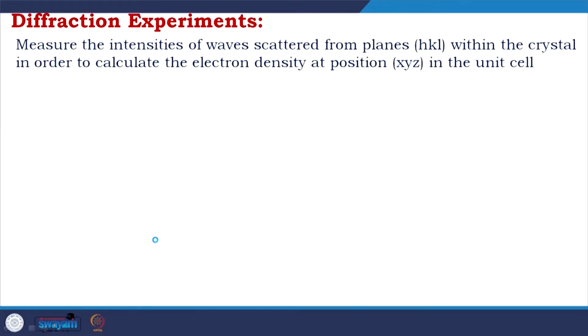So, if I go back a little bit and start where we discussed a lot, we clone a protein, purify a protein and get a crystal. We have discussed a lot about that. So, we get the crystal and what do we do? We do a diffraction experiment.